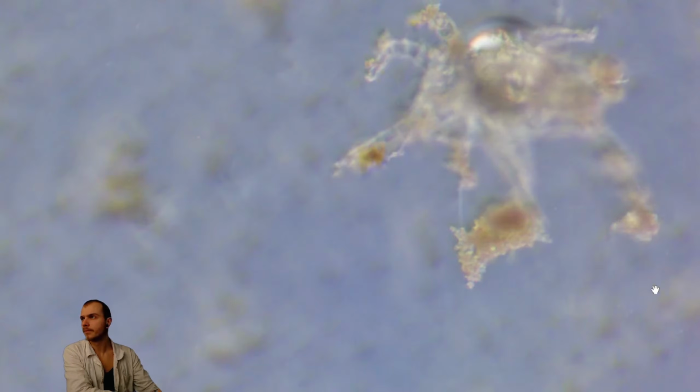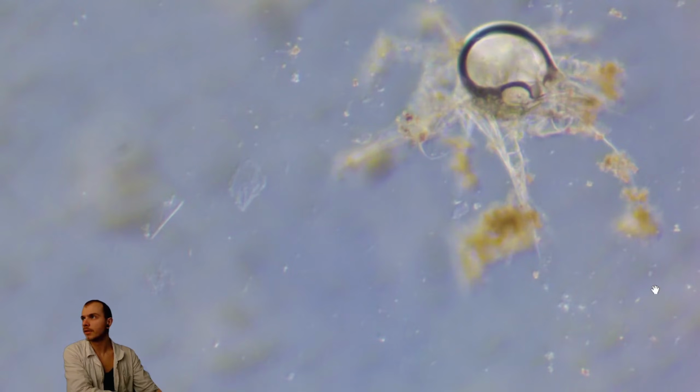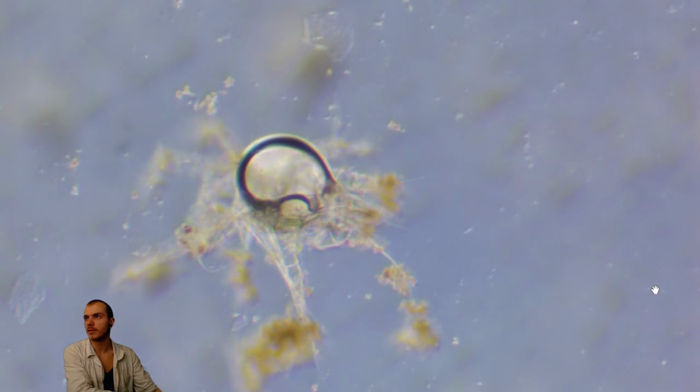These two look like mycelium, and not. This is dust mite skeleton.